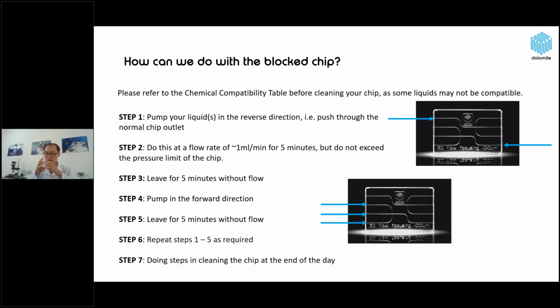With enough time, the solvents can dissolve the contaminant and take it out of the chip.